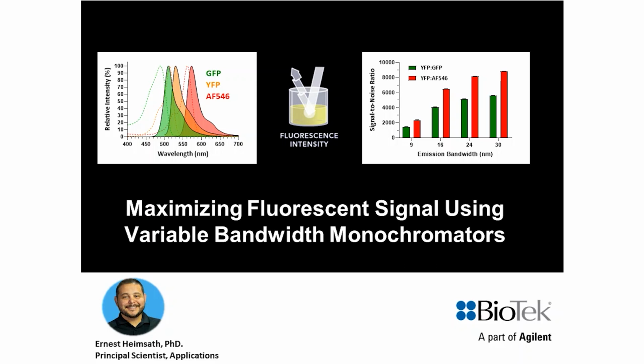Thank you, Bear, for that introduction, and thank you everyone for tuning in today. As Bear mentioned, in this webinar I will be discussing how to get the most out of a fluorescence-based assay using variable bandwidth monochromators.